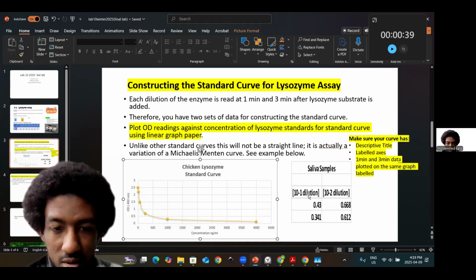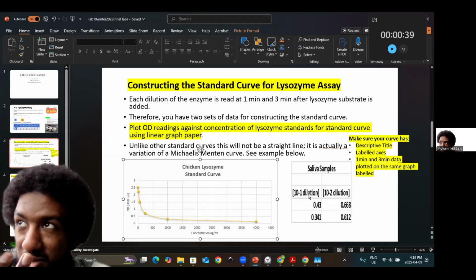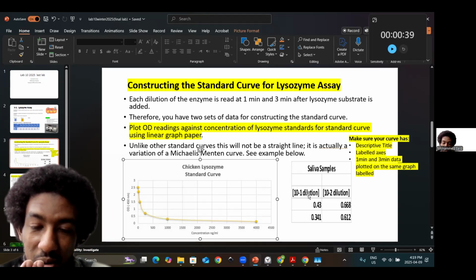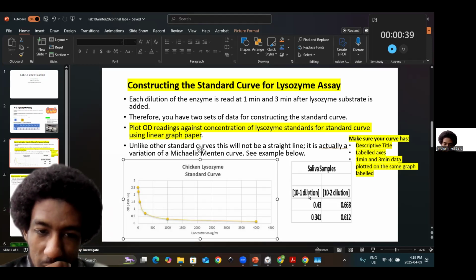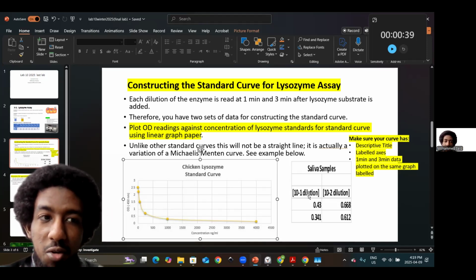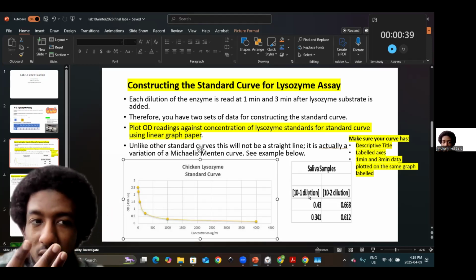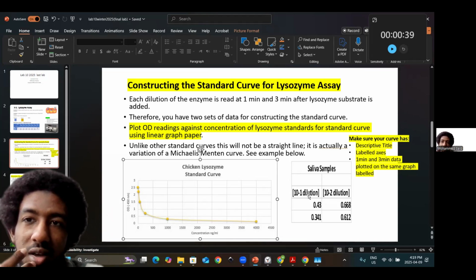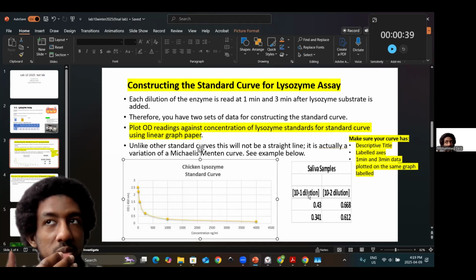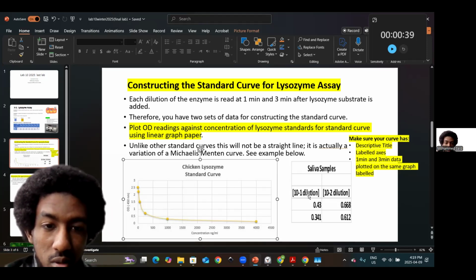So think about it like that: you're not using a mass balance, but you're depicting approximately, under some limitations or assumptions, that those are exhibiting viable cells, right? Because the bacteria are dying. And so you're looking at the turbidity as a result of how many cells are living, to give you a proportional read for absorbance and a proportional effect of the lysozyme.